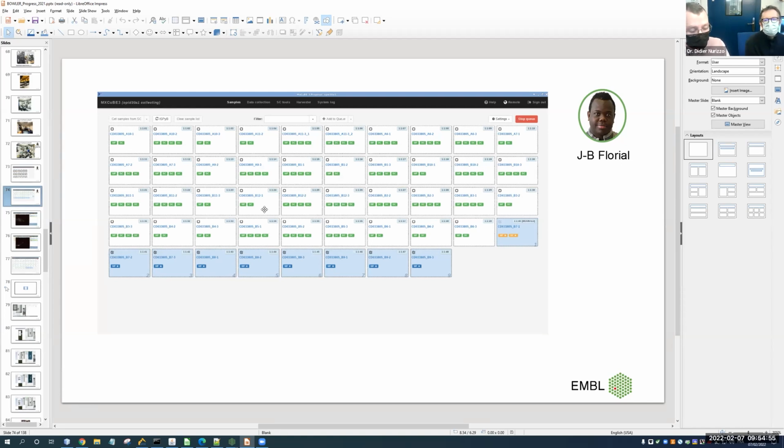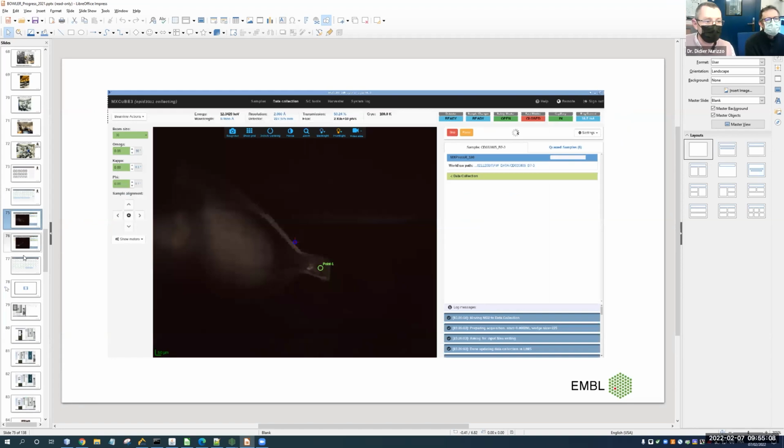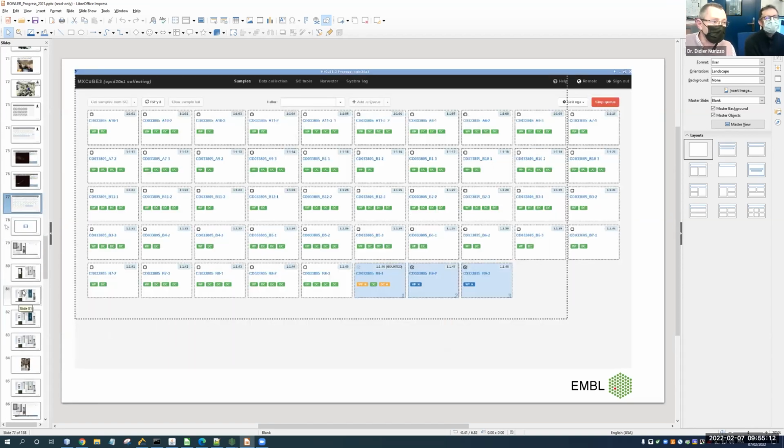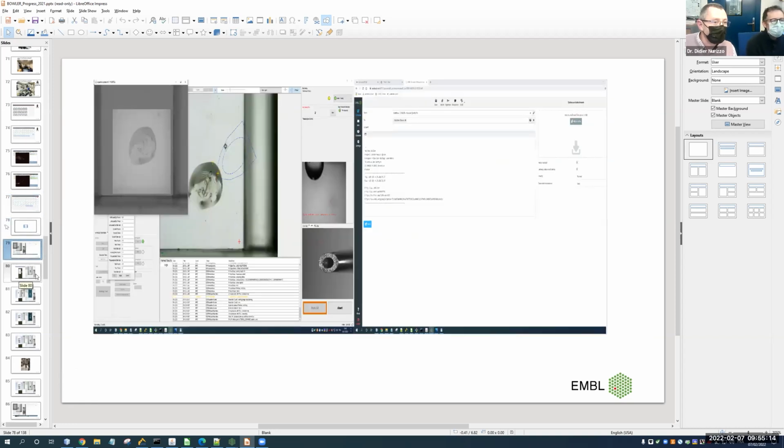We keep the dose to around 100 kilogray. We get reasonable data actually from good systems, and we can play around with that to have workflows that can piece together multiple wedges and things like that. And then everything else runs as it did before, so it's actually very similar.